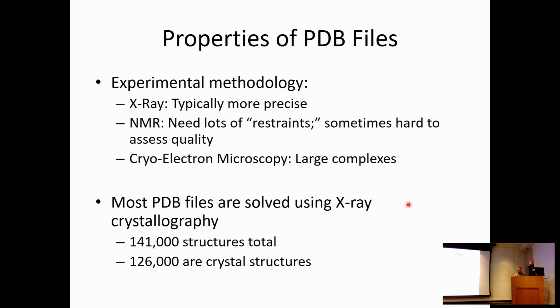In particular, a very common problem that we all face as biomolecular scientists is you'll often search something in the PDB and you'll end up with 10 or 12 different structures. And so the question is, well, which one do you use? Being able to understand a little bit about how the structures are determined can give you some ability to determine whether the structure you're choosing is trustworthy or is the best choice.